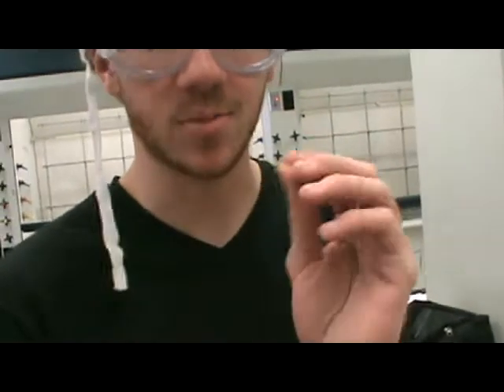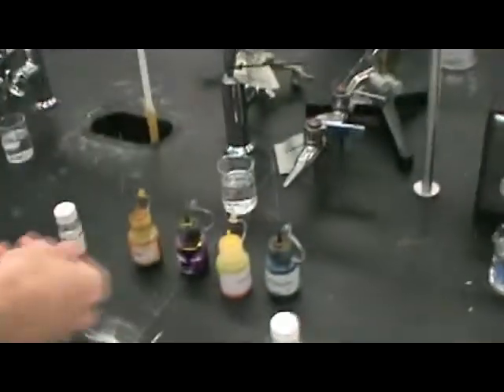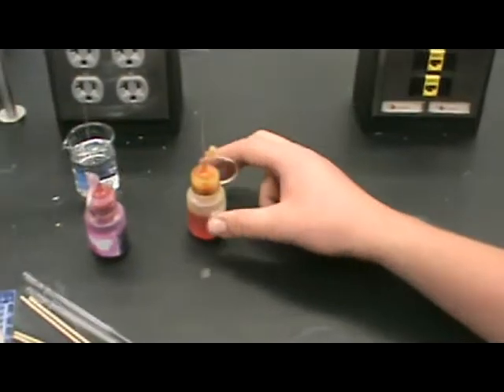These are microcapillary things. You probably can't tell, but these are hollow and made out of glass. And don't ingest them. We put them all in these, and we're gonna call something like spotting. You take it from right here and you just dot each one right here. Oh, wait a second, dude. We need the 1 centimeter thing.